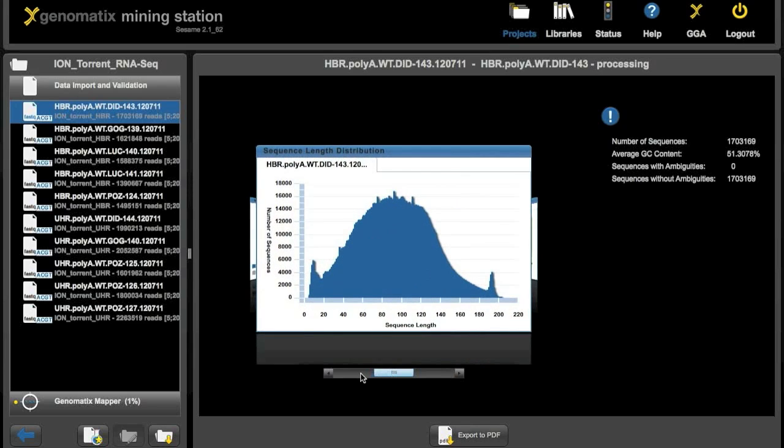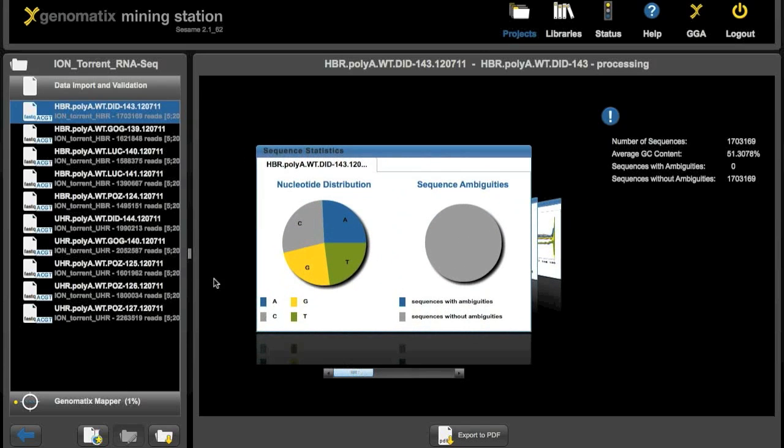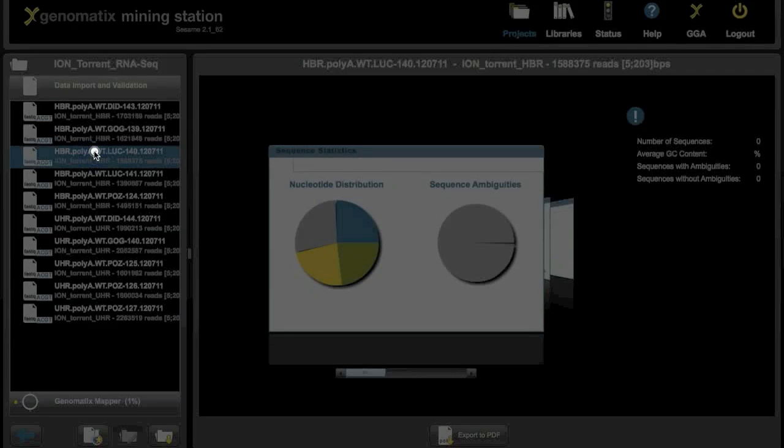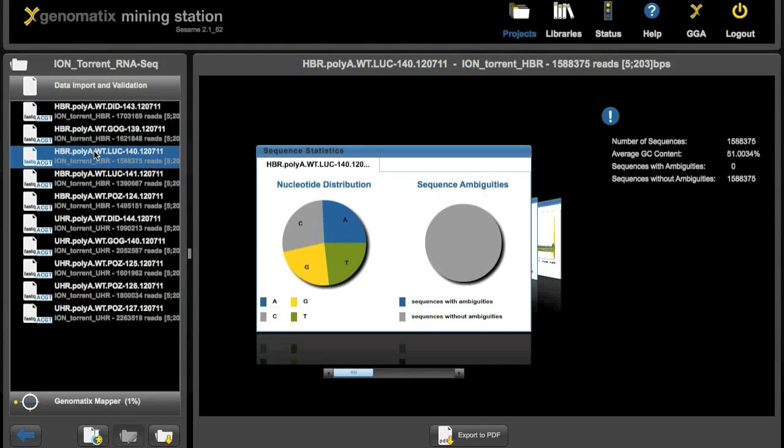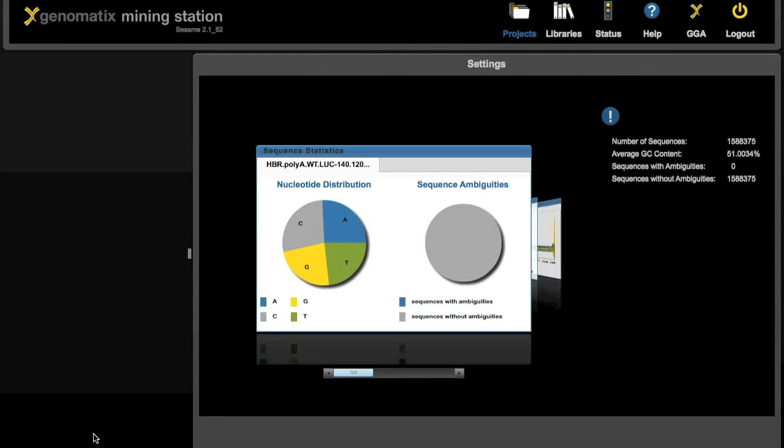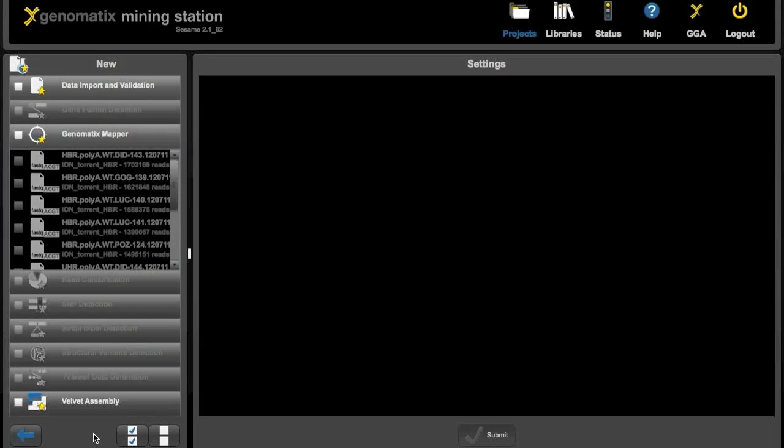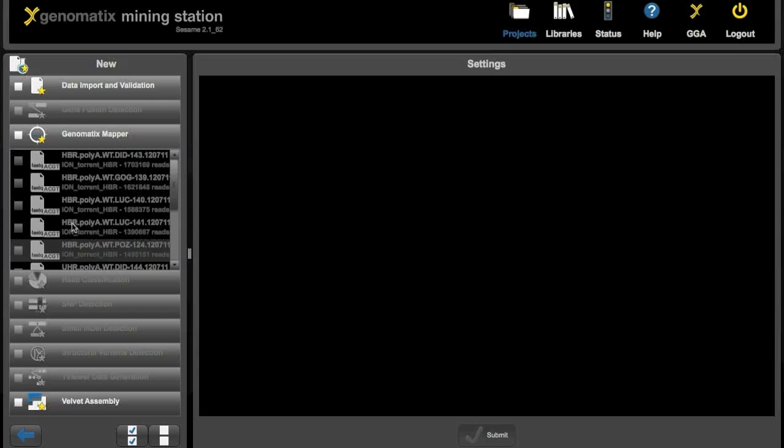Nucleotide distribution, length, overall distribution. We can also show these for each of the files if we want to.